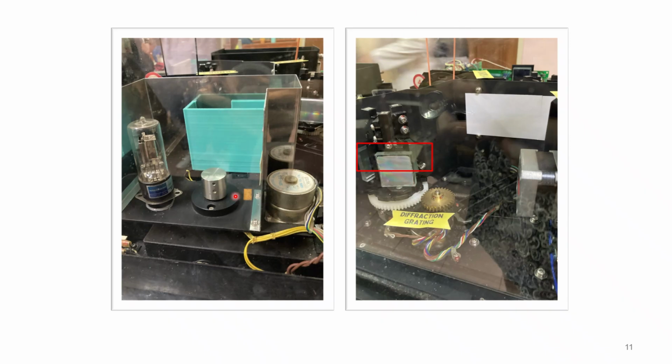This set of equipment is now displayed at the entrance of the Department of Chemistry. So if you have time, you can drop by and have a look at it. Besides, you can also try out how it operates. There is a poster pasted on the wall which explains how this spectrometer works. So you can play around with it whenever you have time. Then you will have a better understanding of how the spectrophotometer works.